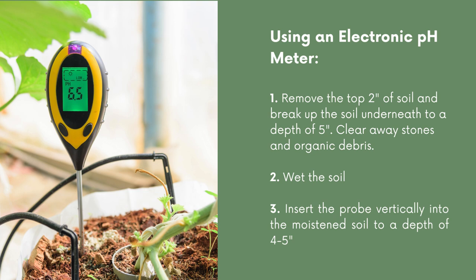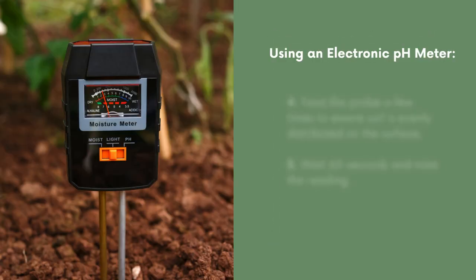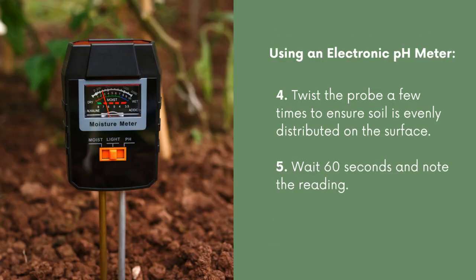Next, you're going to wet the soil. Then you're going to insert the probe vertically into the moistened soil to a depth of four to five inches. Next, you're going to twist the probe a few times to ensure the soil is evenly distributed on the surface. You'll typically have to wait 60 seconds and you should then be given your reading.